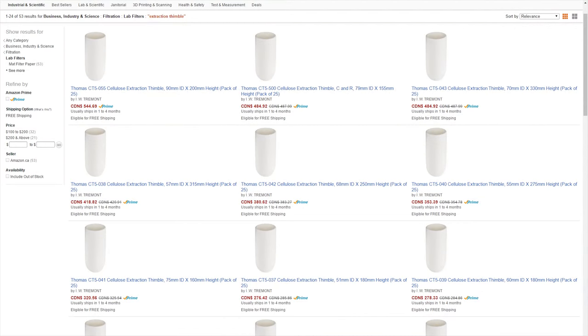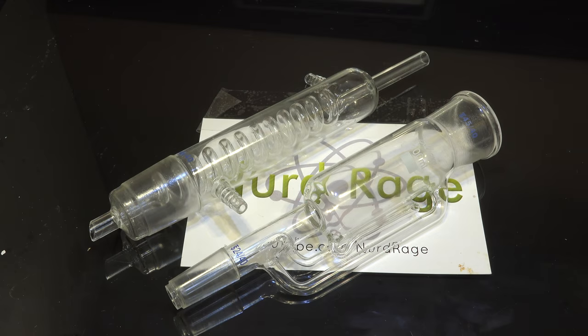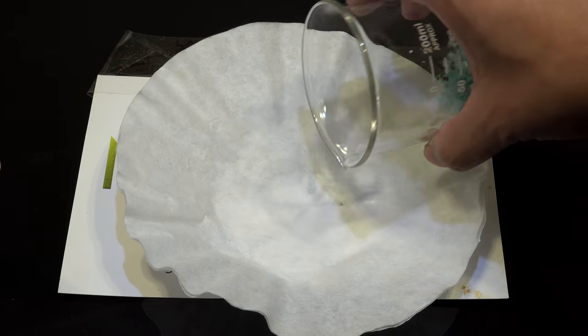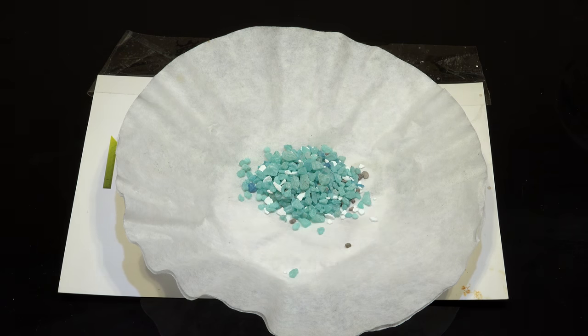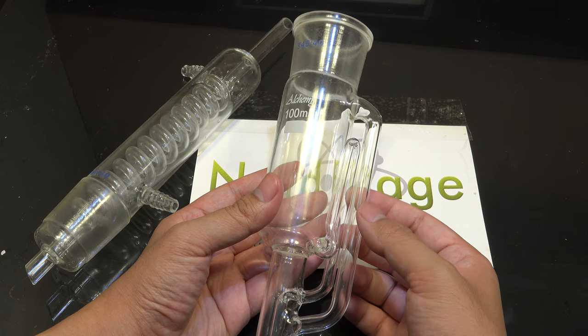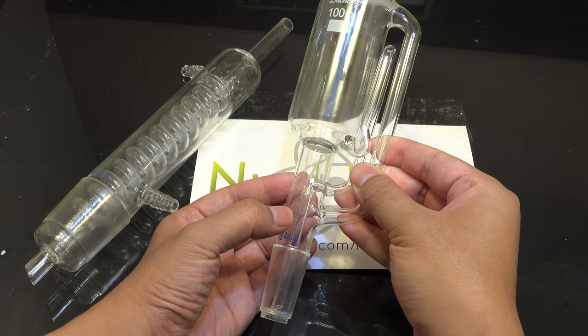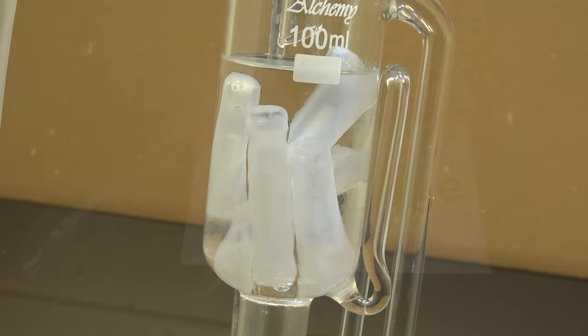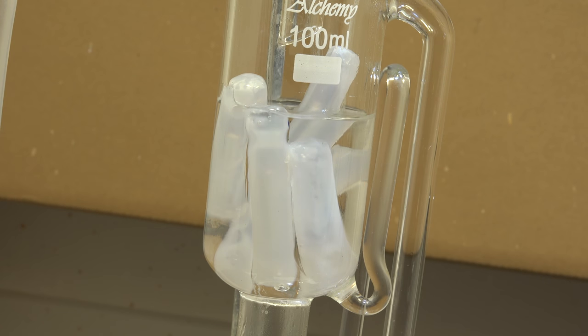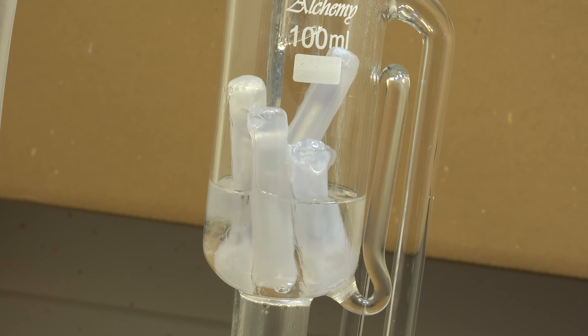You can also buy special filter thimbles made of filter paper especially for this purpose. Alternatively, you can stuff the extractor with glass wool and put your chemicals on top, or buy a special fitted glass extraction tube. You cannot put powdered or granular chemicals into the extractor because they'll clog the thin siphon tube. Getting it unclogged is extremely difficult since it's in such an awkward place. Only in rare circumstances, like if you're dissolving coatings or extracting leaves, can you place items naked into the extractor.